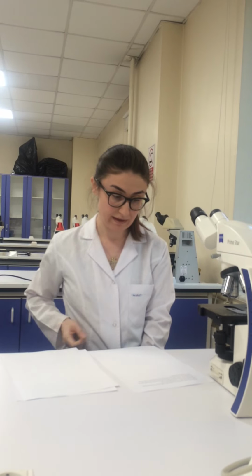for direct staining. The reaction is stopped by washing the cells twice in 10 milliliters of FCS wash buffer, followed by 400 xg centrifugation for 7 minutes. Cells are fixed and resuspended in fixation buffer for flow cytometry according to instructions and publication.